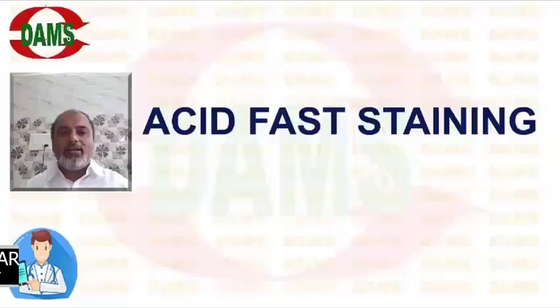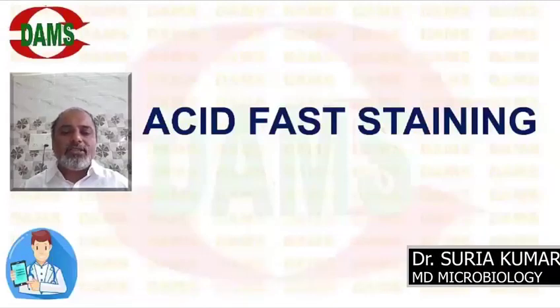Hello, today we are going to discuss acid fast staining, the procedures. It was first discovered by Paul Ehrlich. After that, it was modified by Ziehl and Neelsen. We call it the hot method, and the cold method is Kinyoun's method. So now we are going to see the hot method, the Ziehl-Neelsen method procedure.